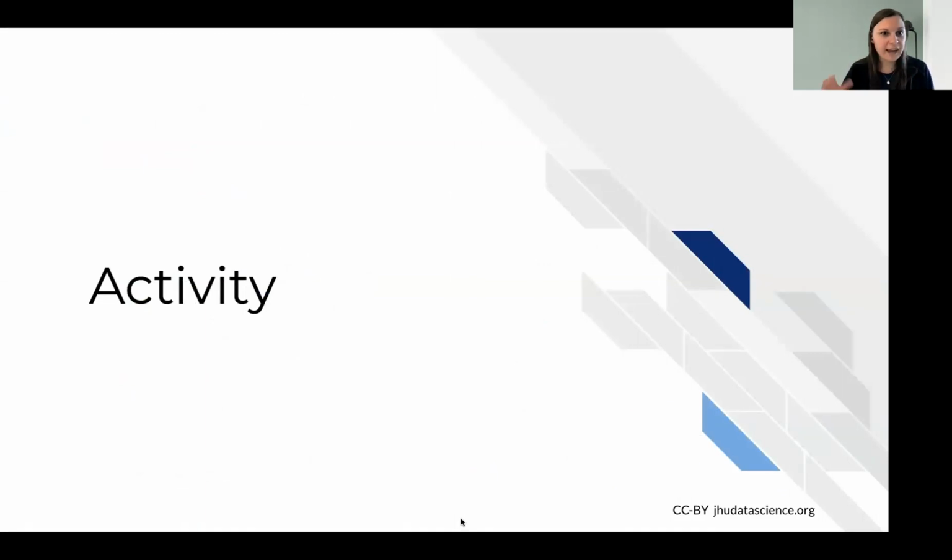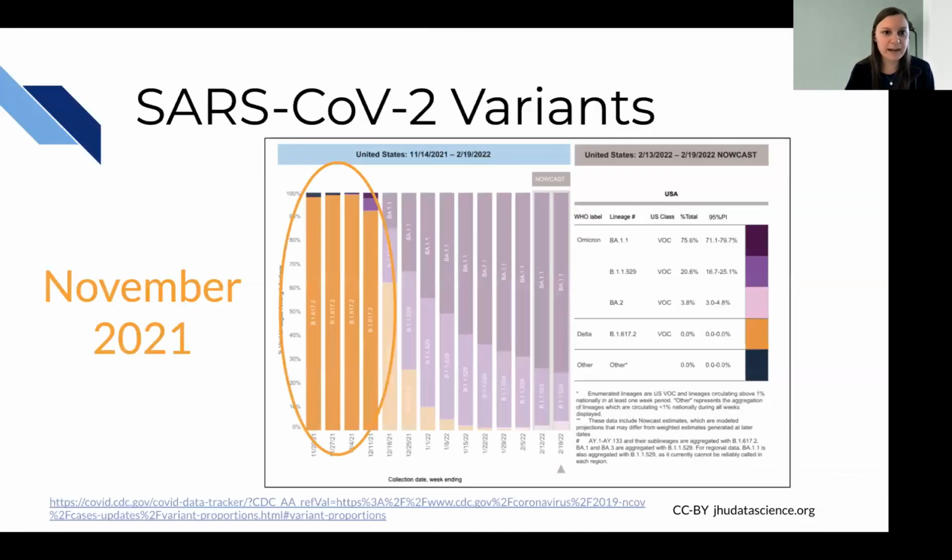So the activity that I'm going to be highlighting today is going to feature a little bit of science, but mainly as a way to teach how you can use Galaxy in AnVIL. So a little bit of background on that. As we're all familiar with the COVID pandemic, there were a number of variants that cycled through, and Galaxy was part of the effort to analyze these variants and help to do some of that surveillance. So there were many viral samples that were collected and that are publicly available. And as we might remember, in November, there was the rise of the Delta variant.